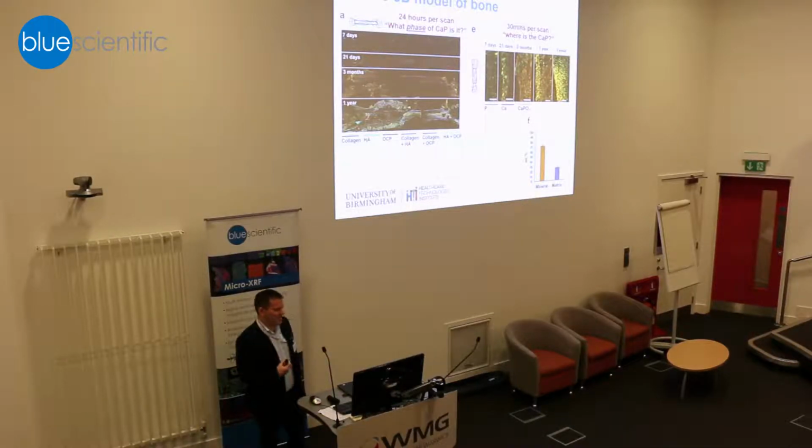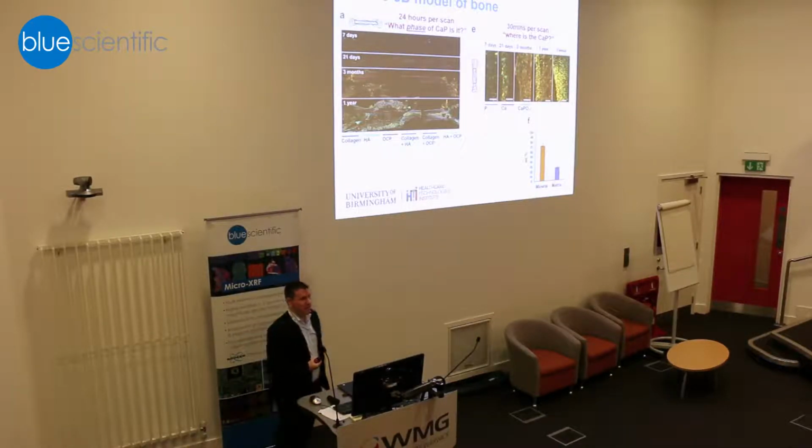As a consequence of that, we had to scan our samples often for 24 to 30 hours at a time, and then it became destructive. You just destroy the sample over time. And that's not really scalable. We can't really be making hundreds of these in one batch. We need to be smarter about how we characterize the samples.